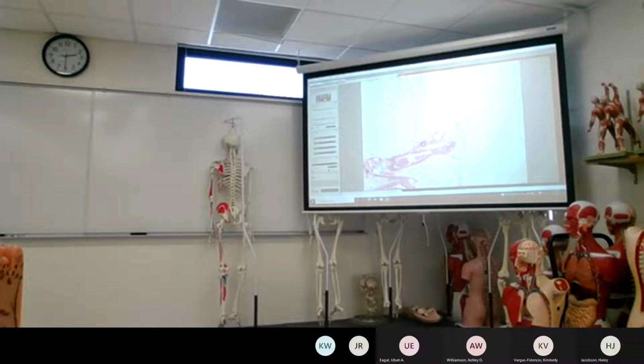Now, if this person was to lose a lot of fat mass, those cells would just shrink in size, and maybe some of the space between them could fill with more connective tissue and material, but the number of cells would not go down. They would just become smaller cells. Okay? All right, so going to slide 9.